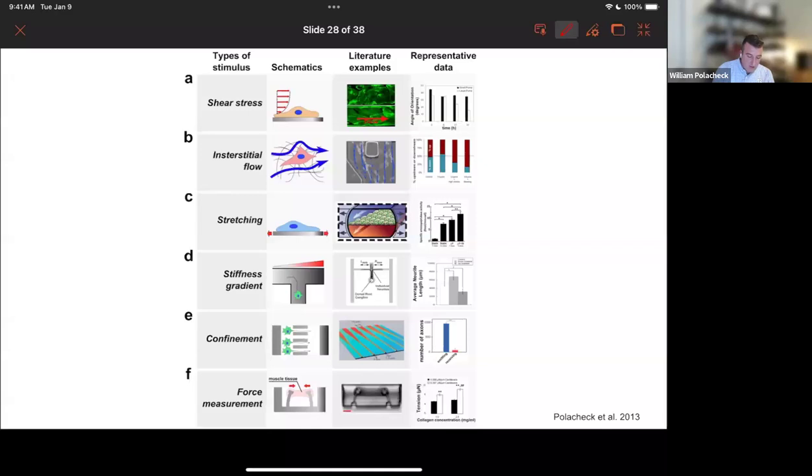Obviously, there are lots of flows to simulate luminal flow in ducts or vessels, but also interstitial flow, something we're quite interested in. And because PDMS is compliant, not compliant at a scale relevant to individual cells, but compliant enough that you can stretch it, if you apply sufficient mechanical forces, then you can recapitulate substrate stresses and strains using the device.